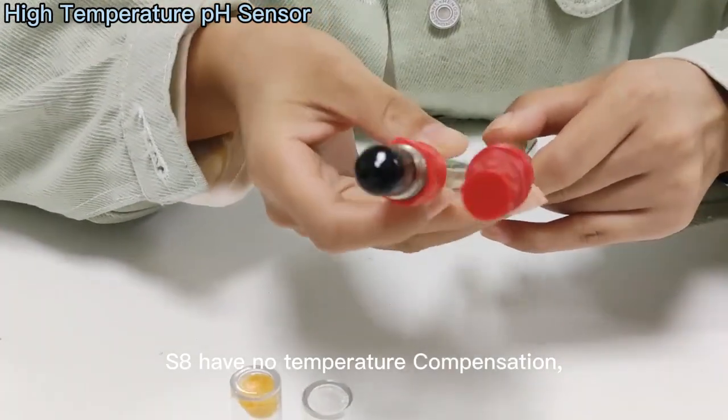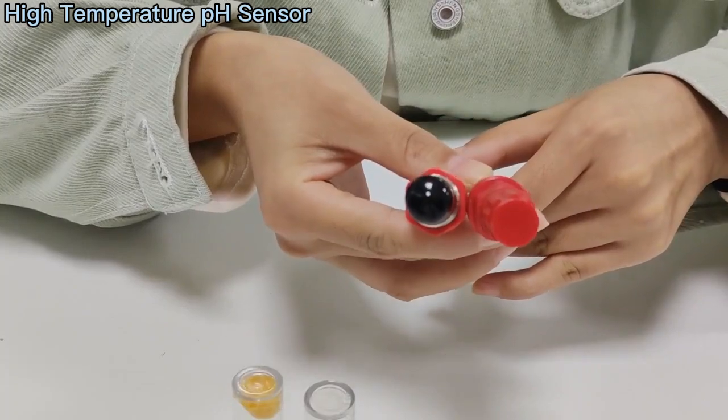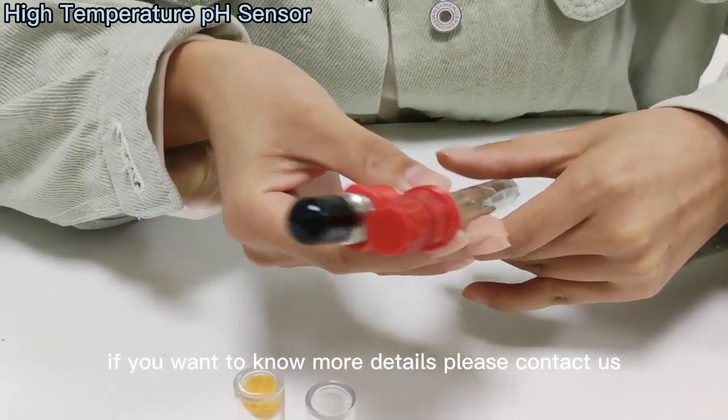This one has no temperature compensation. They are usually used in fermentation tanks, biotechnology, and so on. If you want to know more details, please contact us.